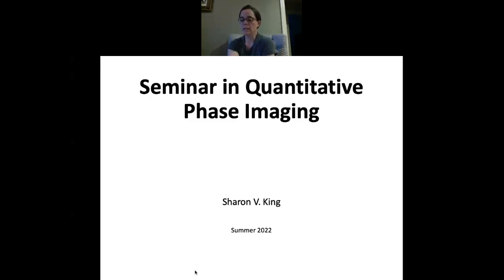I'll be talking today about quantitative phase imaging by presenting you a variety of imaging methods that are transmitted light methods as opposed to fluorescence imaging methods. My intention and my hope is that you'll become familiar with ways that you can introduce contrast in a sample, reveal interesting biology, but without using fluorescent labeling techniques.